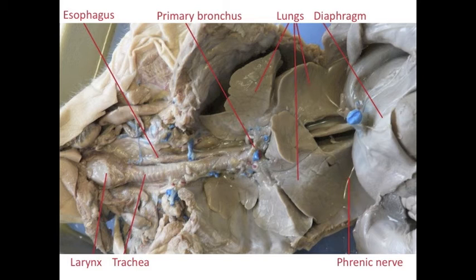The diaphragm, shown on the right-hand side, is the muscle that can contract and increase the volume of the thoracic cavity. It is innervated by the phrenic nerve.